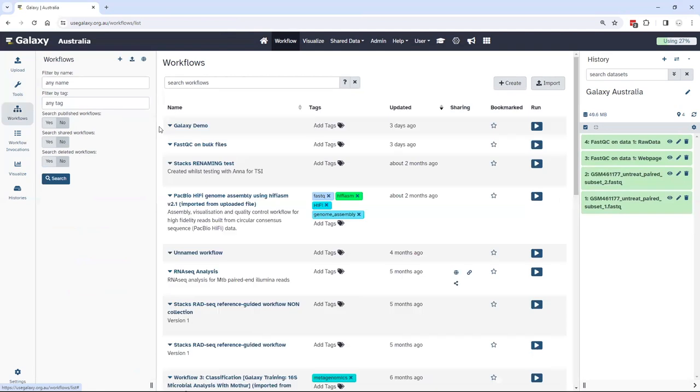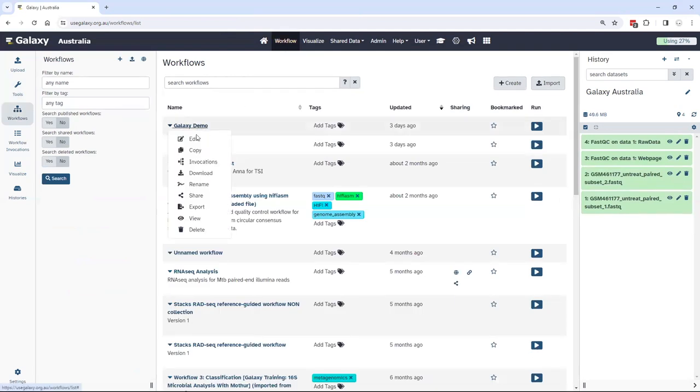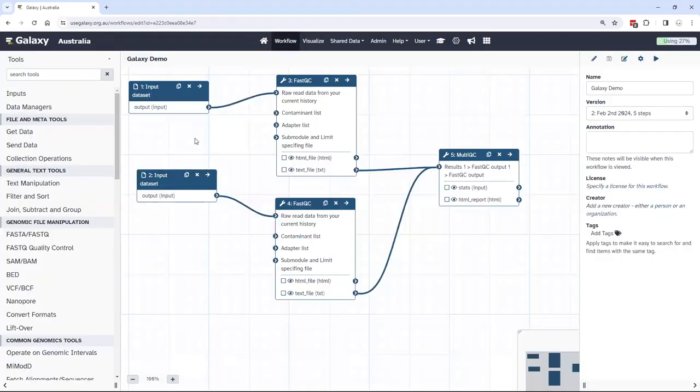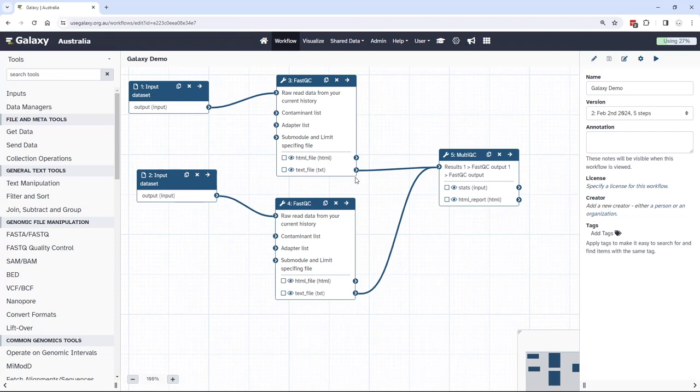I have a workflow in my workflow menu called Galaxy Demo, which I will show to you what it does on this workflow canvas. It takes two particular inputs, it passes each of those into the FastQC tool, but importantly it takes the results of that FastQC and passes them into MultiQC.